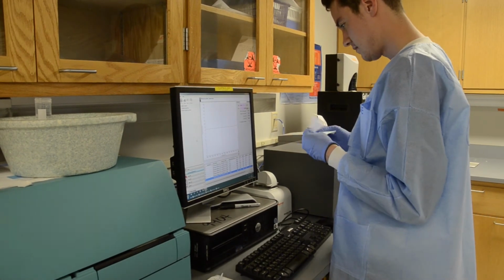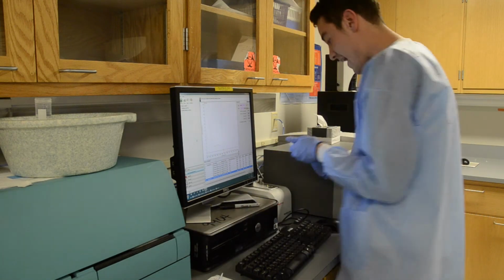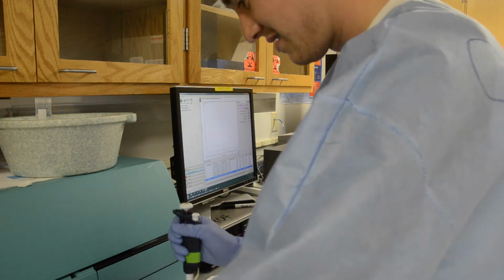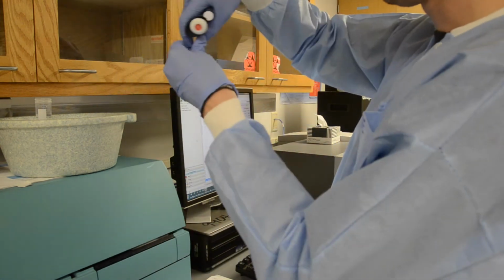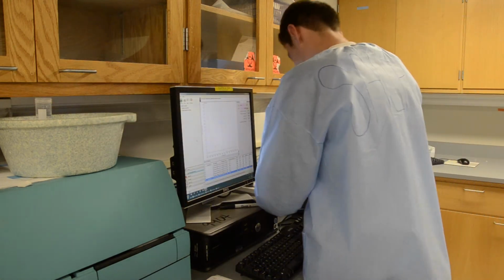Clean the sample holder with a Kim wipe and pipette 1 microliter of your first sample onto the sample holder. Press measure. Record the concentration and the 260 to 280 ratio of the sample in your notebook. It may also be helpful to print a PDF of the screen.